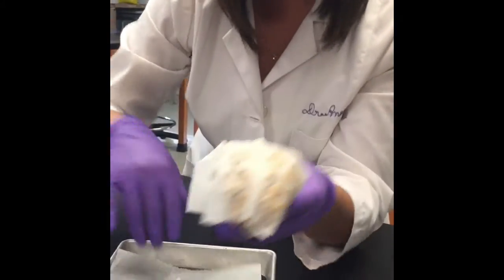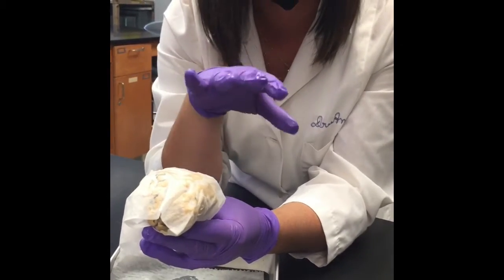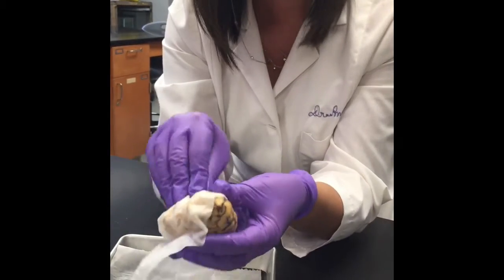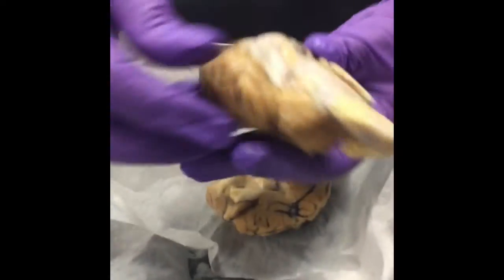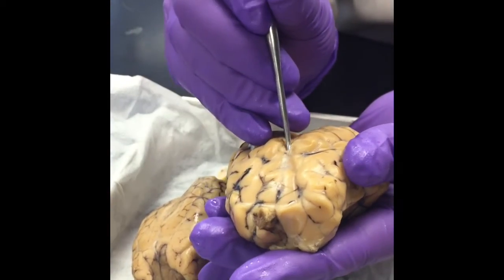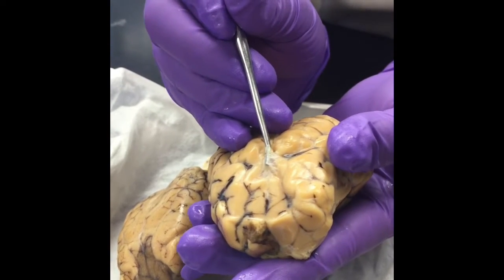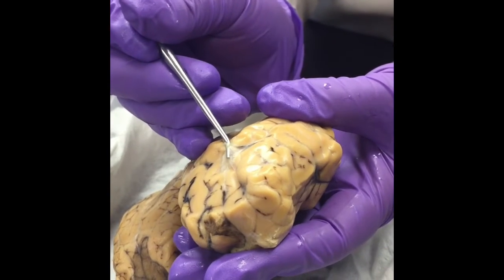So that outer dura mater has been removed from most of this. Believe it or not, it's still in the cavity somewhere else. But you could see little pieces of it left, like you could see pieces of it left on the brain here. Underneath the dura mater, there's another thin layer of meninge called the arachnoid mater. And I can actually get my probe under it and lift it up. It's a clear membrane. Can you see that? And that's the arachnoid mater.